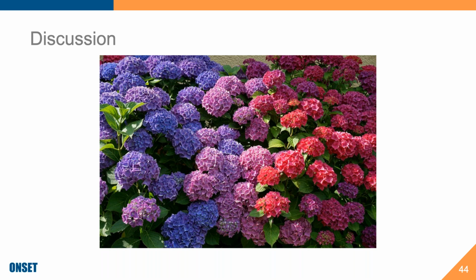The goal is to keep your electrode, those inner and outer gel layers, hydrated, as well as the junction. To do that, the best way, I would argue, would be to have it sitting in a storage solution. It is possible as well to have your electrode in a cap that has a wet sponge in it. That would keep it moist too, I guess. But for our products, we recommend soaking it in solution.